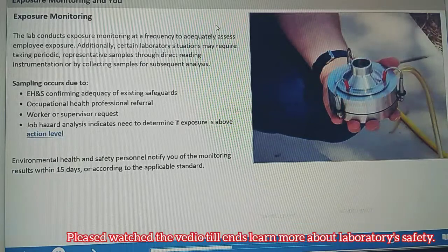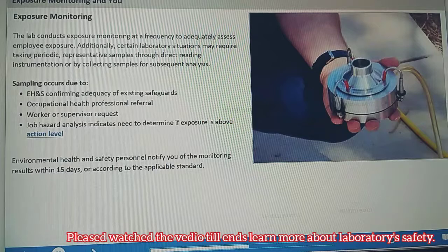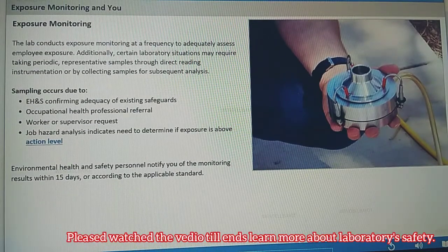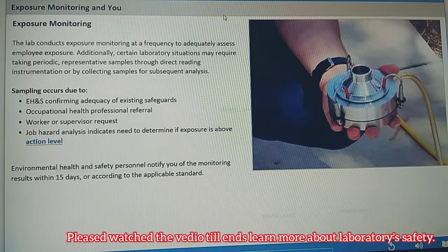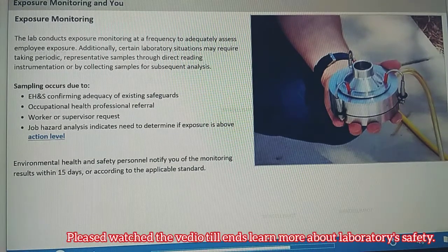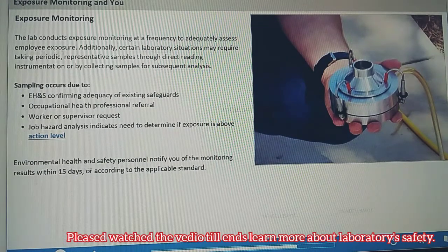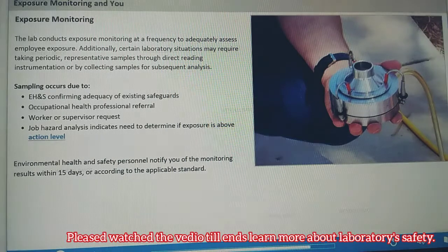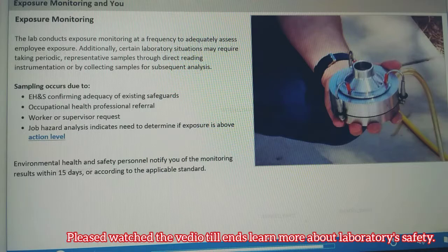Sampling occurs for a variety of reasons. Environmental health and safety personnel perform sampling periodically to confirm the adequacy of existing safeguards. Occupational health professionals, workers, and supervisors can request sampling due to a specific instance of exposure or suspected exposure. Job hazard analysis might also indicate the need for sampling to determine whether exposure is above the action level. Your environmental health and safety personnel will notify you of the monitoring results within 15 days or according to the applicable standard.